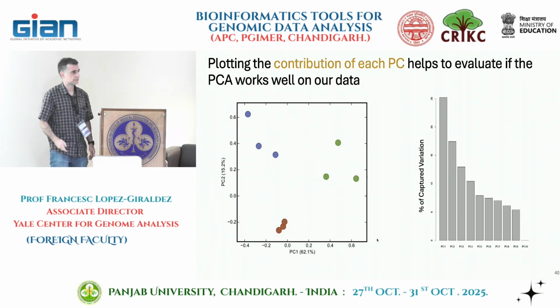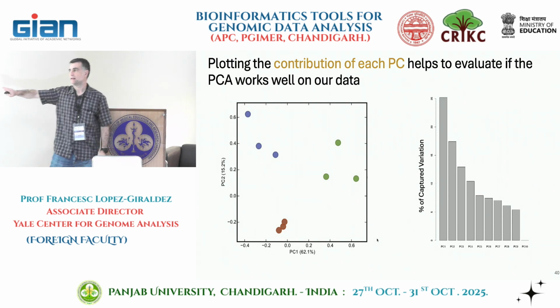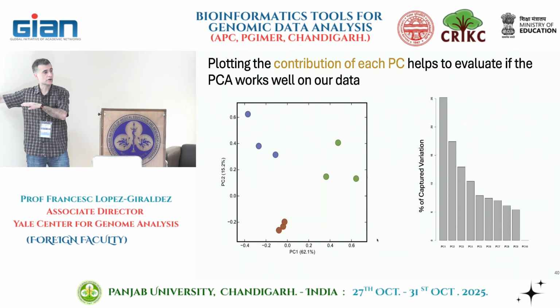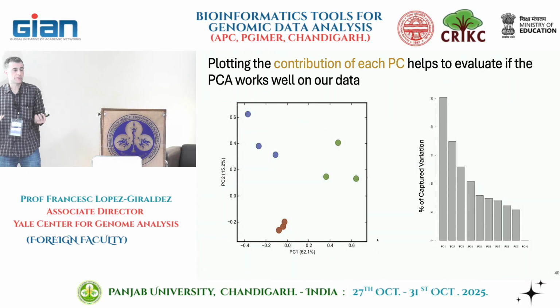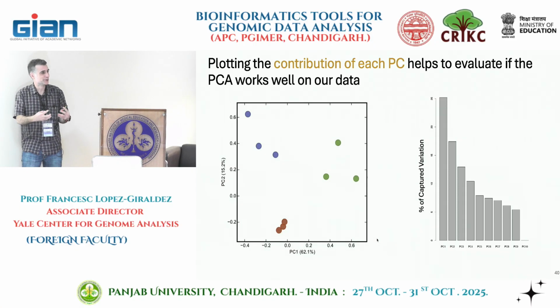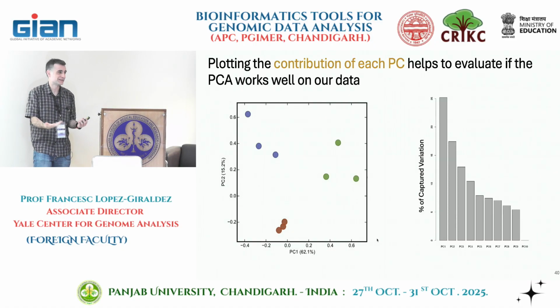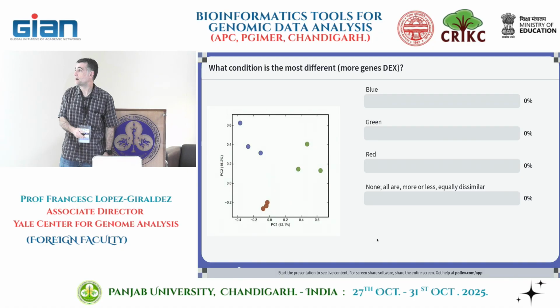So can we modify according to our... No, you could modify your formula, but you're not going to use the percentage of information for anything, just for you to know how much, because you're not going to be able to change that. It's your data. Your data tells this. That's it. So if your data is really flat, it's going to be really hard to explain, right? It's going to be almost impossible. We can skip that for now.